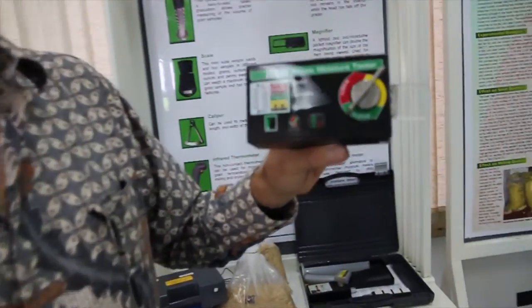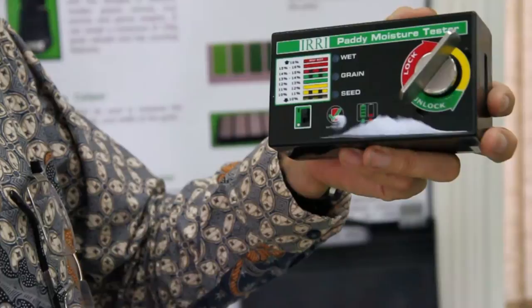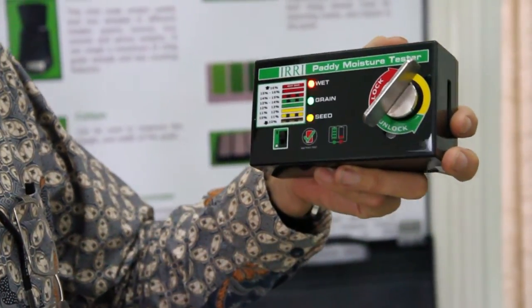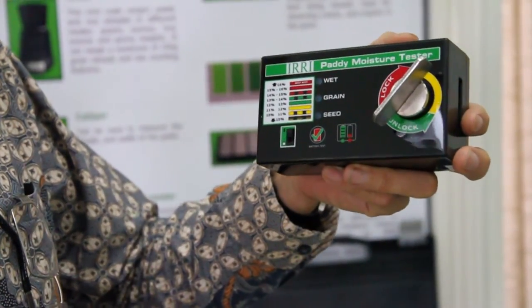The way this instrument works is that instead of having a digital display, it just has three indicator lights. The lights basically give an indication about whether the grain is wet and needs to be dried, indicated by the red light, or whether it's sufficiently dried for storage, which is represented by the green light, or whether it's dry enough to be stored as seeds.